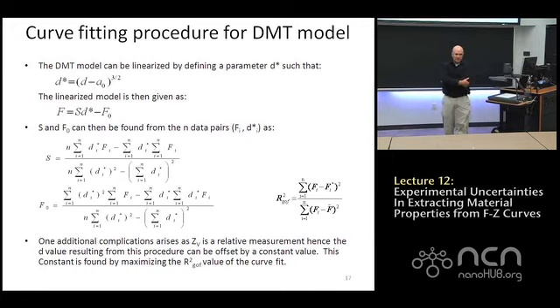Well, it's not really part of the fitting process. It's kind of separate from it in the fact that we're saying that we're going to maximize R². So choose D equals 0 such that R² is maximum. What you can do is do many fits for all choices for D equals 0, and then choose the one with the highest R².